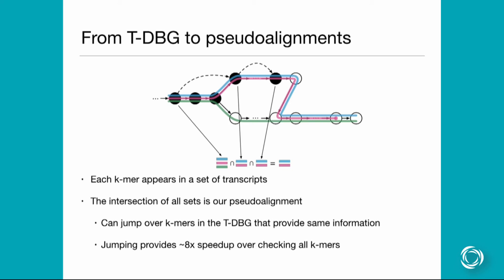So yeah, it's in the BAM file. I mean, the information is encoded in the BAM file. But the thing is that you can't use Cufflinks to identify SNPs, is what I'm saying.